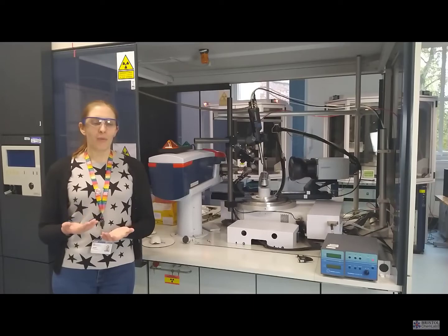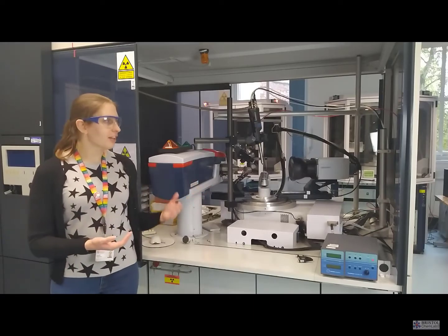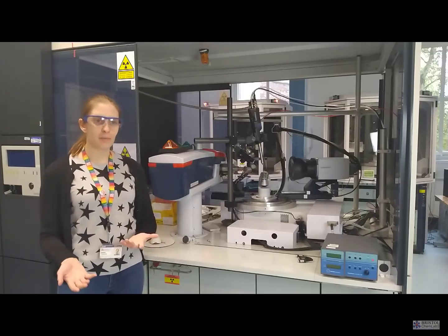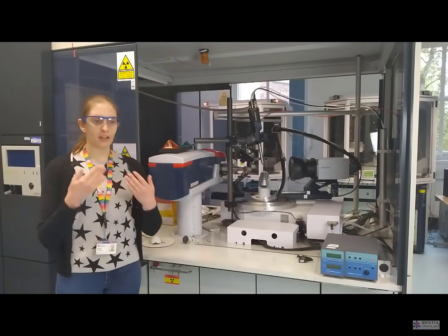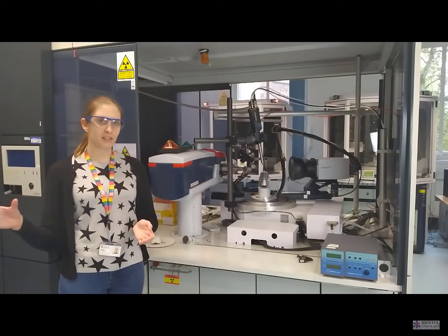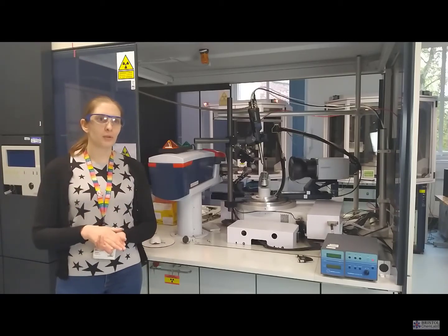They used to be done by hand, these calculations. So when crystallography first started, rather than the complex detectors we have now that send all the information to the computer, you would use a photographic plate to measure your diffraction onto, and then take that and by hand work out the positions, and then use that to calculate your electron density map and therefore your structure from that.